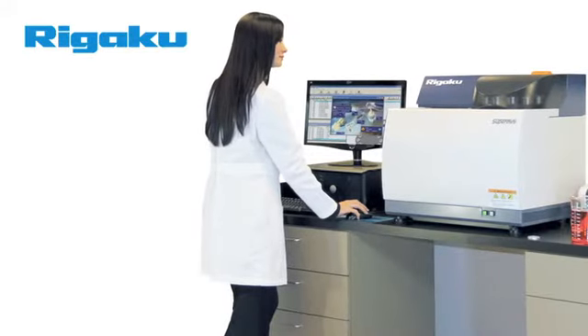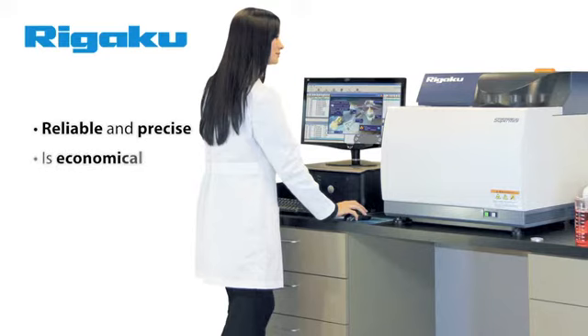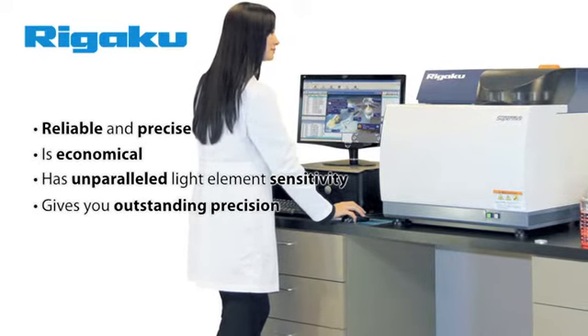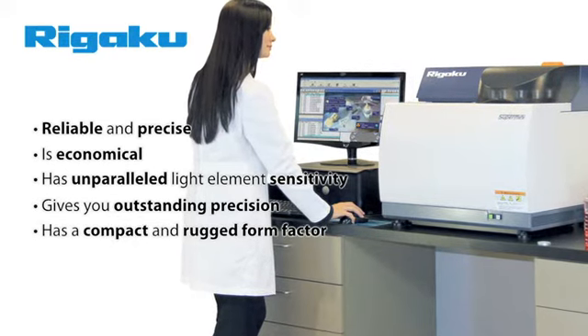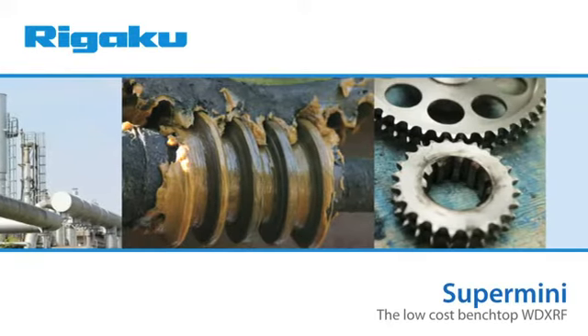With Rigaku's new Supermini system, you are getting a system that is reliable with low true cost of ownership, provides unparalleled light element sensitivity, delivers outstanding precision, has a compact form factor for minimal lab footprint, and is easy to learn and easy to use.